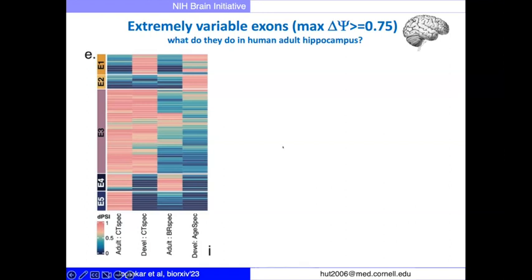And so for these, we can now have multiple dimensions of variation. This difference could come out of cell types present in an adult brain region. And here we plot now these delta values. Okay, so red means very, very high values. So this would be adult cell type specificity. We could also have cell type specificity early on in development, for example, P14 or P21. We could have differences in exon inclusion between the same cell type in two brain regions. That's this here. And between the same cell type at different developmental time points, for different ages.